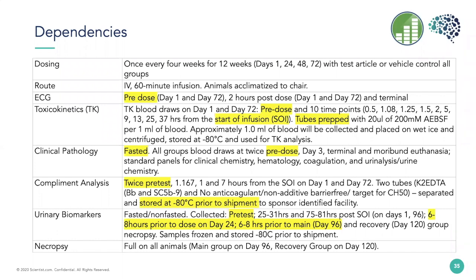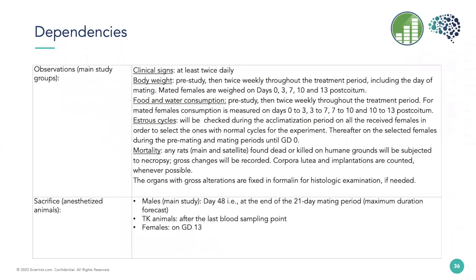And it's not enough to just assume that these things are done. You need to note them somewhere to prove the dependencies were considered and that procedures were completed correctly and in the correct order. This is another example of a small animal study for DART.